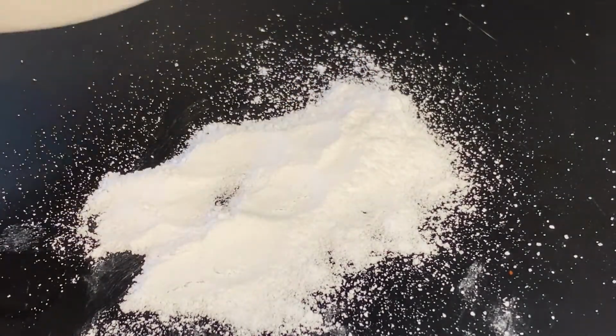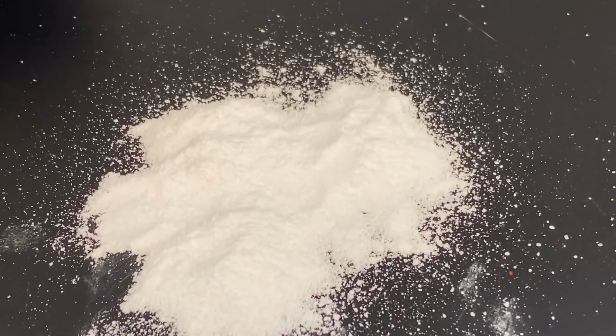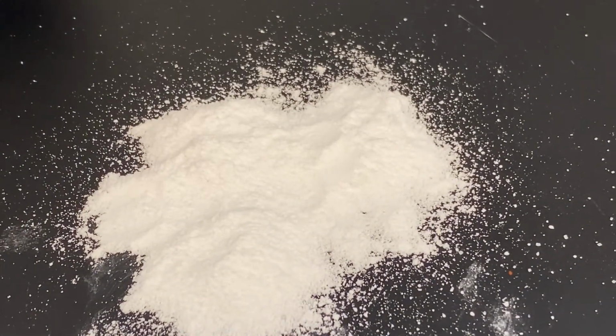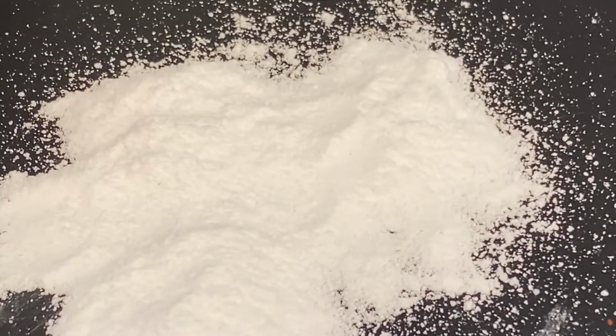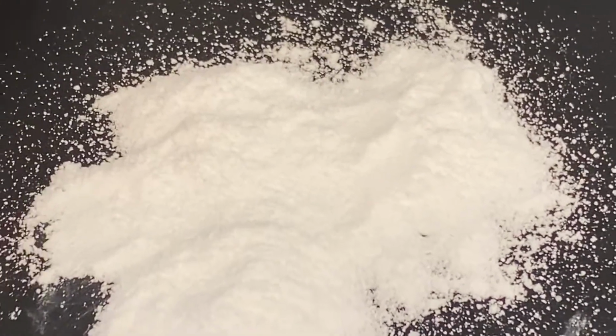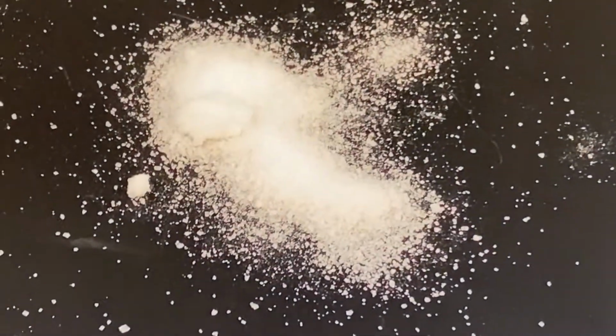Let's pour some more out here. The color has not changed. The color's still white. If anything, it's a little brighter, although I don't see as much shininess in there as I did before. Let's rotate the camera and see if we could catch any light. It's lost some of its luster or shine as opposed to the grains here.